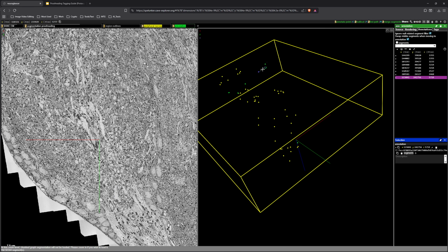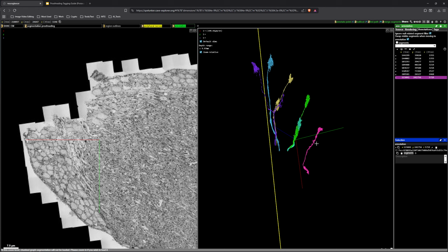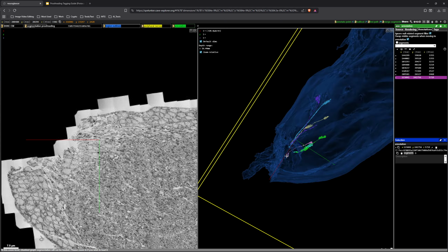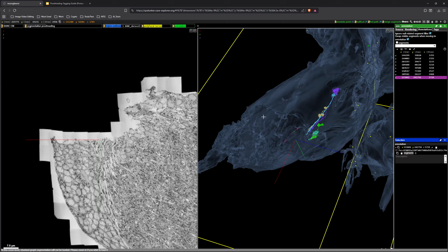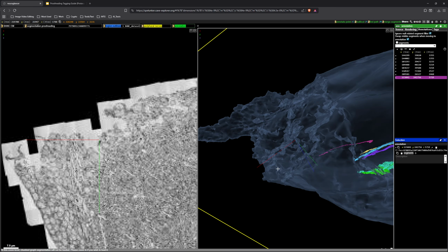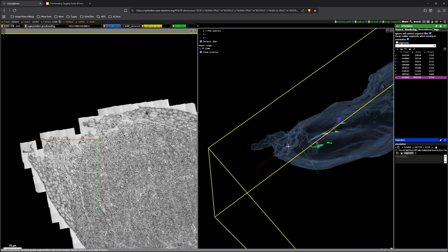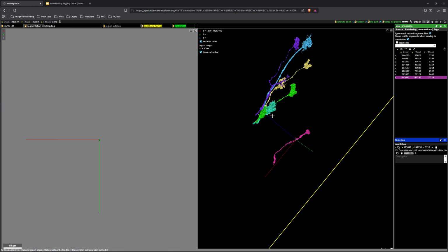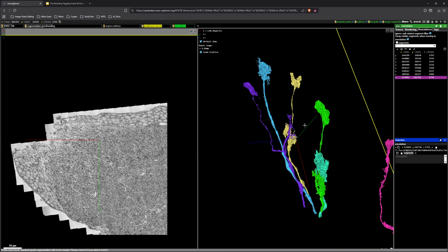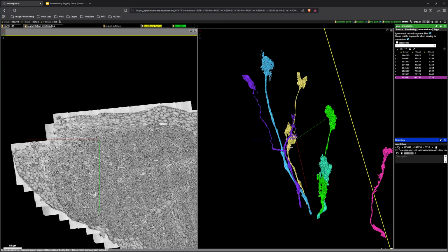All right. And now for the final examples, I have a collection here. And these are from the optic lobes. As you can see, there's no peripheral nerve annotation point here, but even just looking at the brain mesh, this is quite torn up, and it's entering or leaving the data set from here. So you've probably seen a lot of cells like this. There's a variety, right? Sometimes they got a big cluster up there. Sometimes they got one up there and one down here.